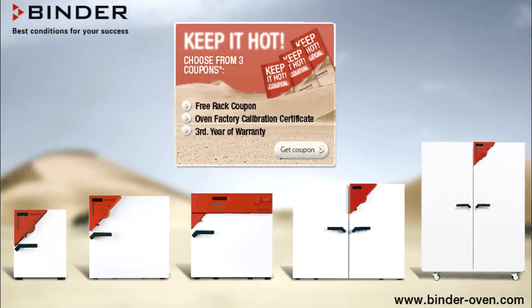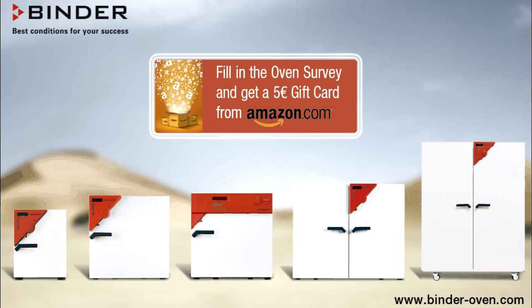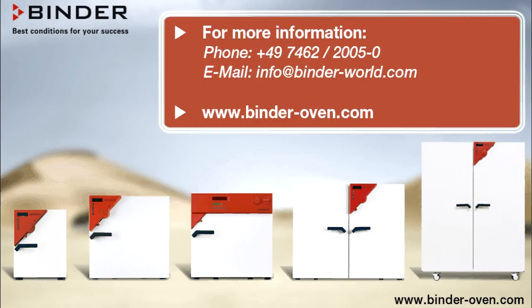Whatever your application may be, Binder has an oven that will meet your needs and provide superior performance for your investment. For more information, contact your Binder representative today. Binder, best conditions for your success.